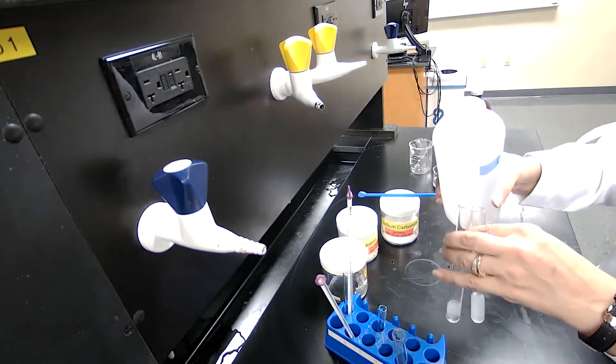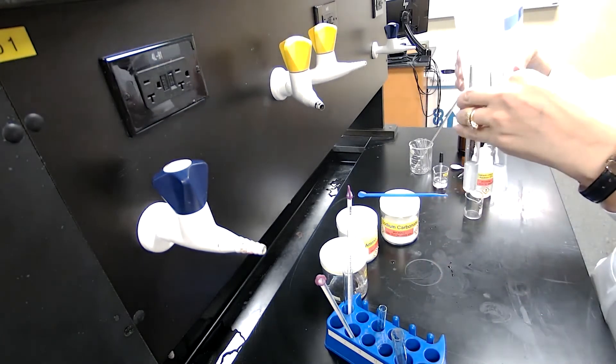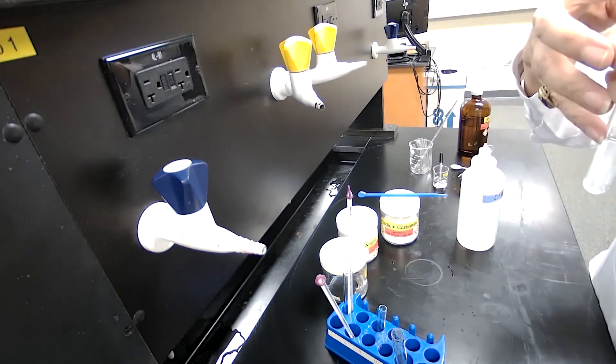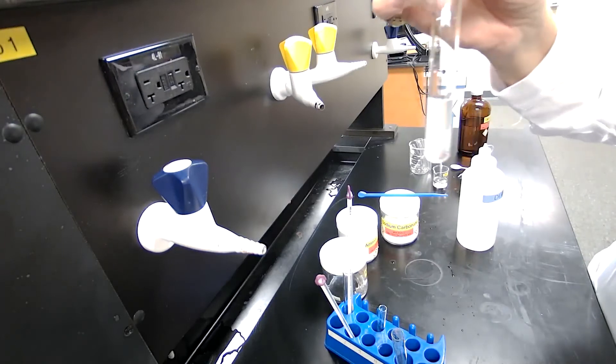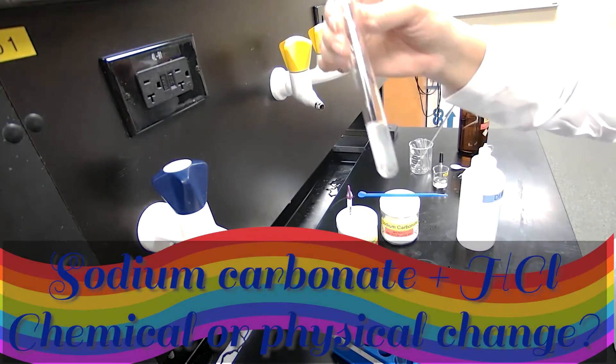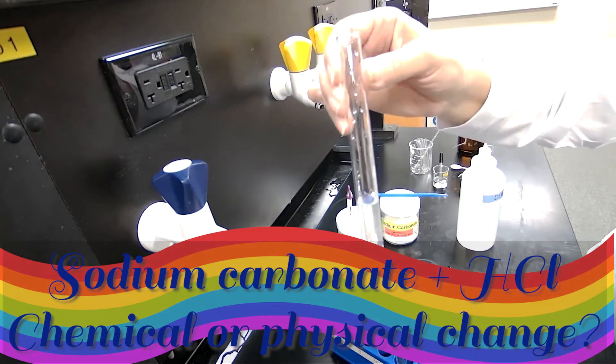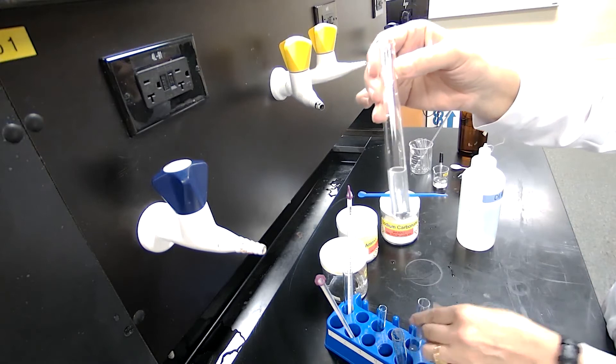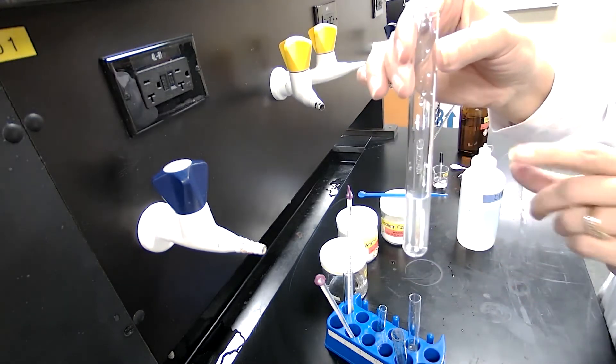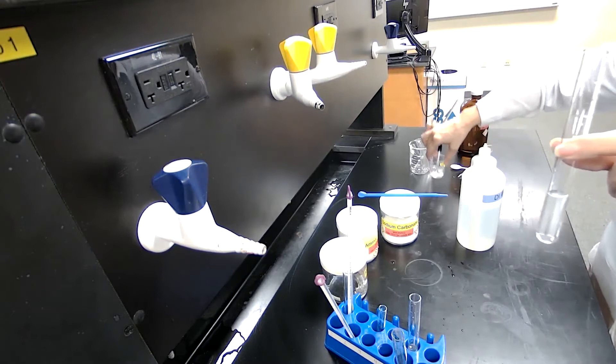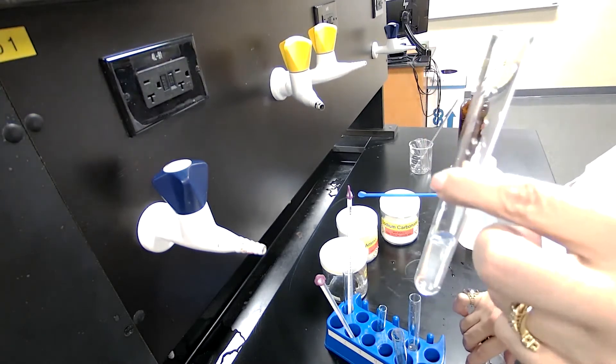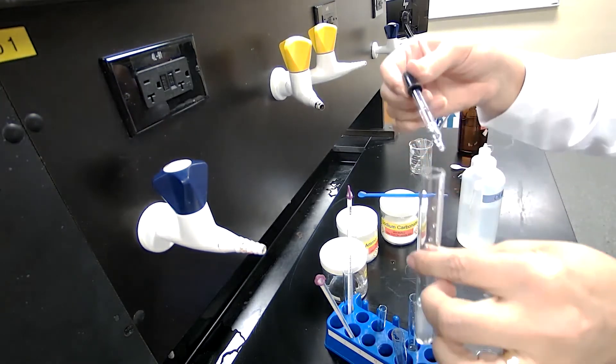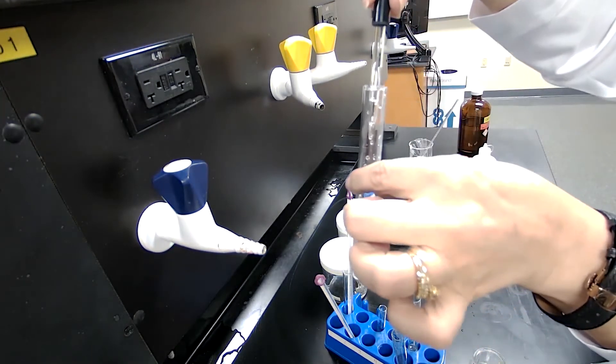I have my test tube A and test tube B prepared with sodium carbonate. I have the sodium carbonate solution prepared. To test tube A, the procedure is asking me to add HCl. So I would add to test tube A, this is the test tube A from part three of experiment two. To this test tube I would add drops of HCl to sodium carbonate.